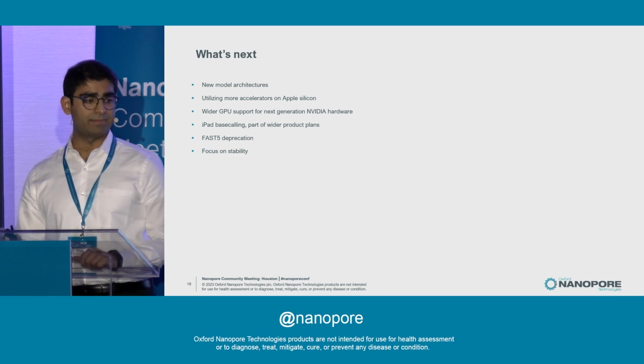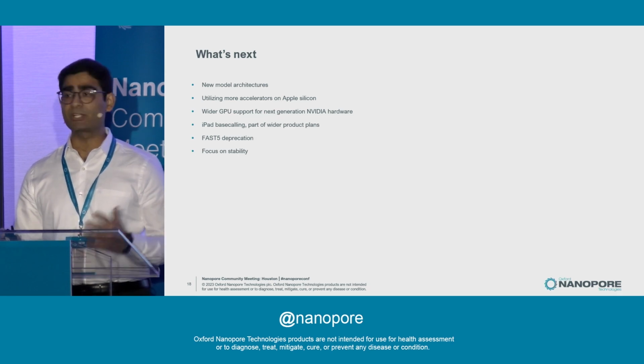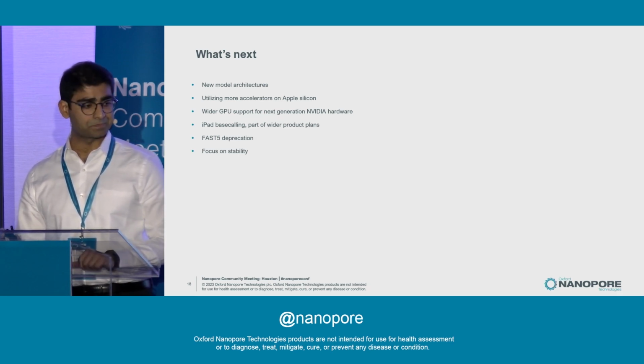iPad basecalling is something we're actively working on, and we're making quite a lot of progress on that front. You'll actually be hearing more about that in a talk tomorrow.